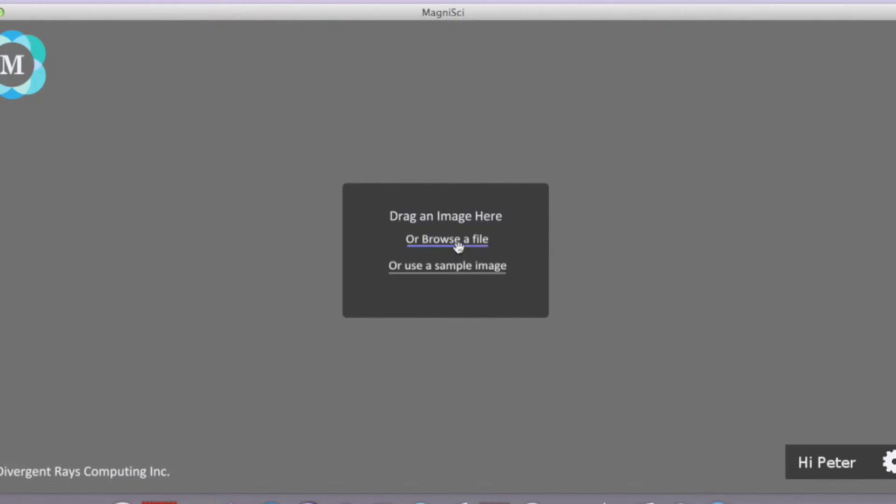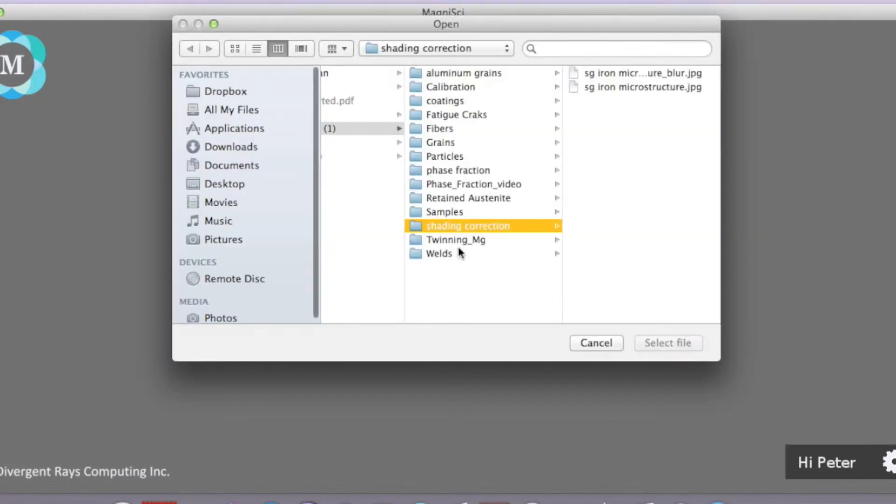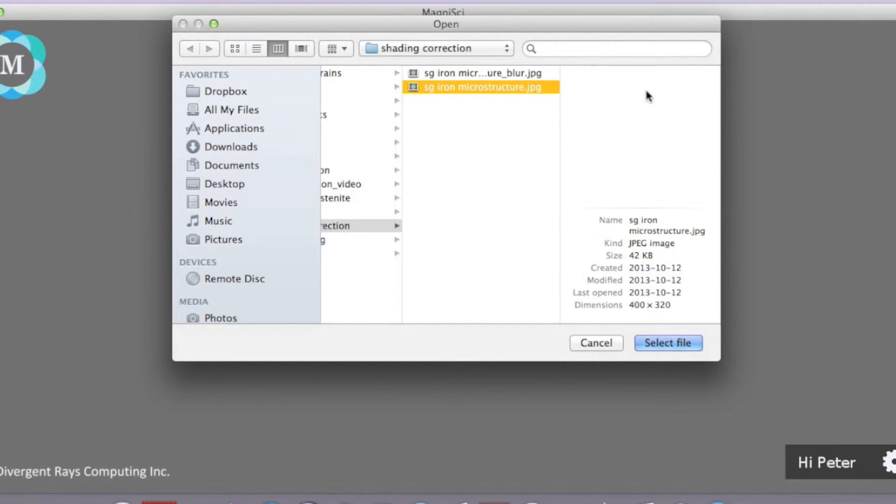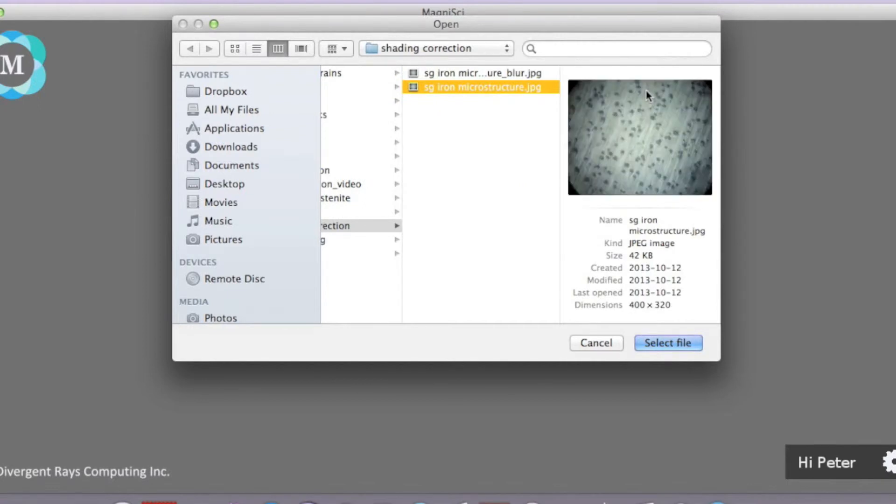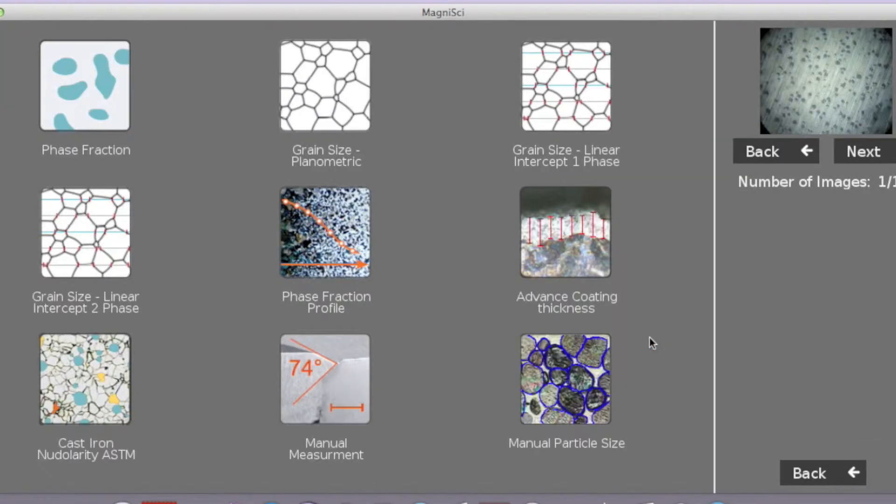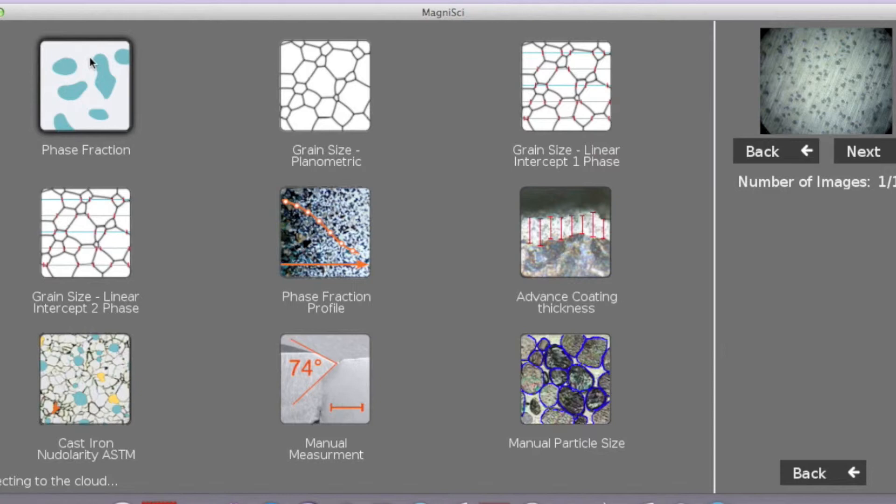We will first select an image that has a terrible problem with illumination and we will fix it. We select any app for analysis. We will select this one for now.